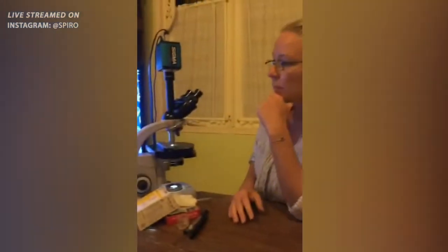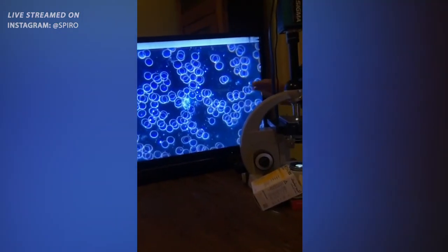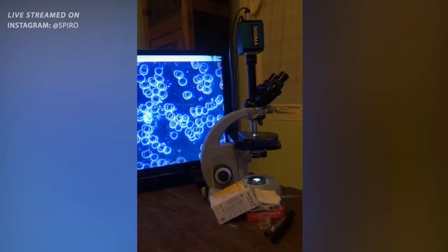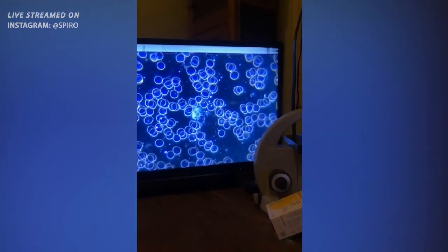Do you want to add anything before we look at it? No, that's pretty much it. So what is also important actually is the serum space is clean like here, so there shouldn't be any things what you will see soon on the vaccinated people. So we found very strange stuff in his blood, which I haven't seen in 30 years during microscopy. So when did your patient come in? This client, when did he come in, and when did you test his blood, and what vaccine did he get?